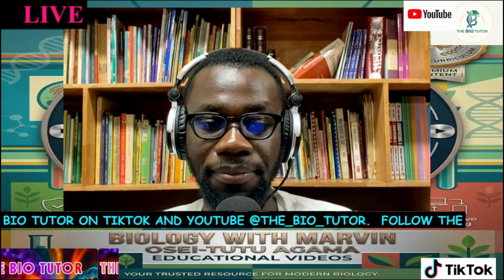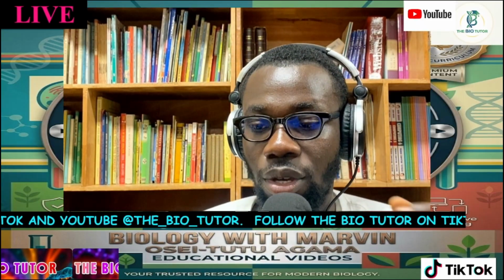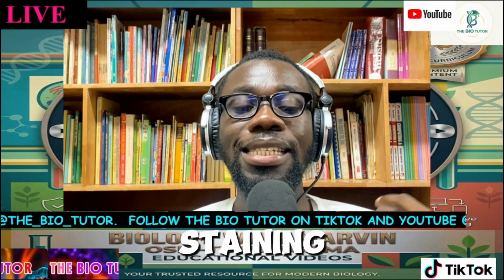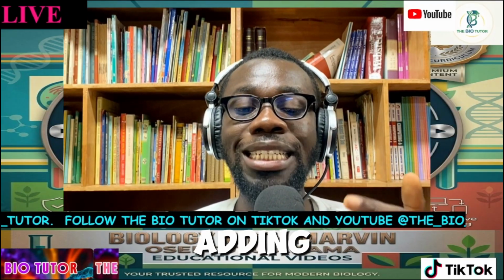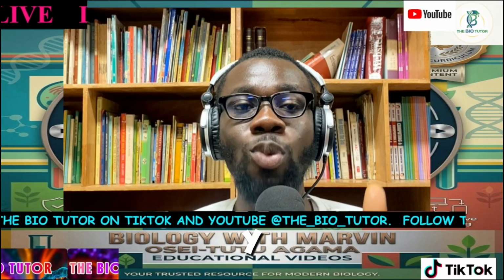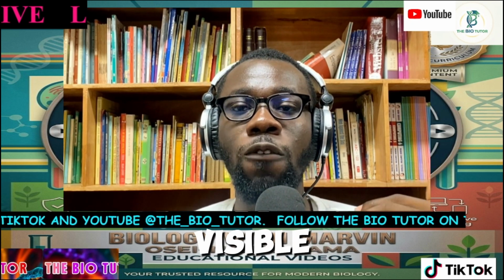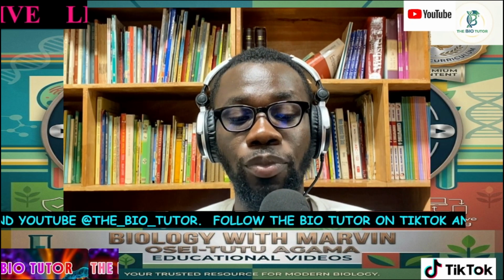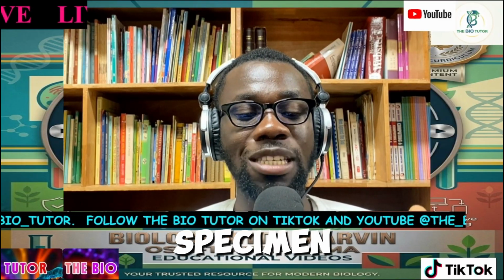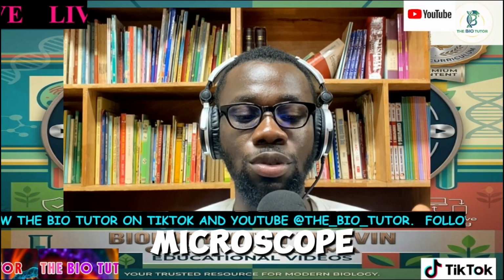Staining. When we say staining, staining simply means you are making the specimen visible. So let's look at the definition for staining. Staining is the process of adding a colored dye, the dye is not D-I-E, but D-Y-E, to a specimen to make it more visible under the microscope.